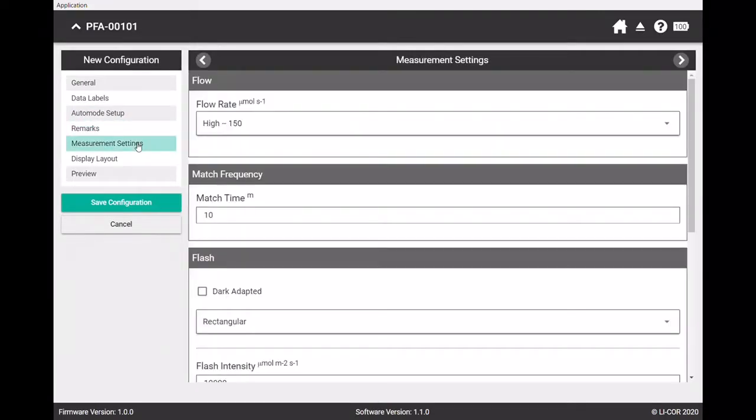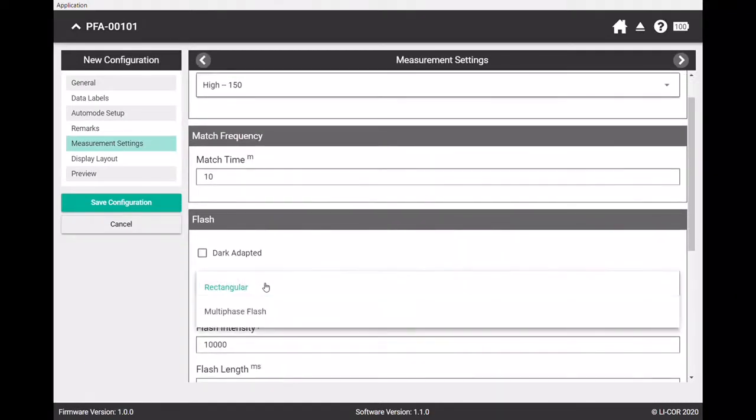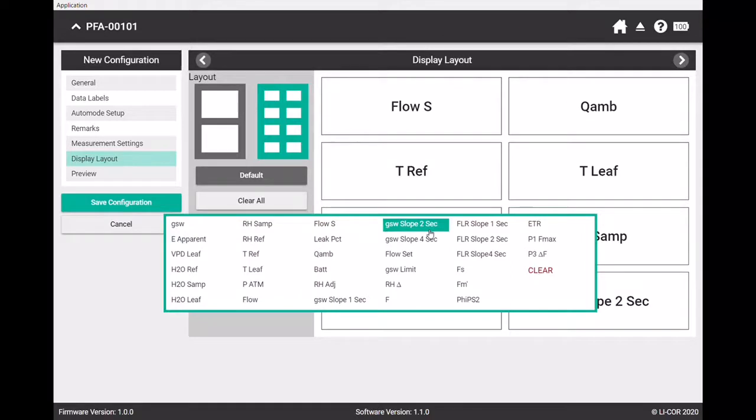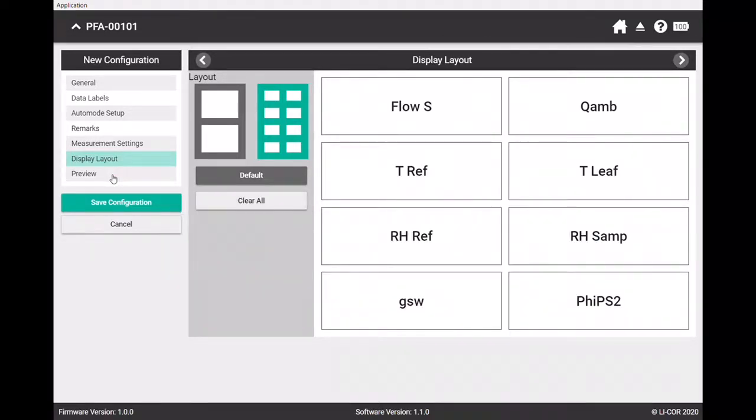Measurement settings, I want to do MPFs. We'll go down to display layout. This looks fine. As long as I have my conductance and my fluorescence, I might want to add my fluorescence. We'll add something here.